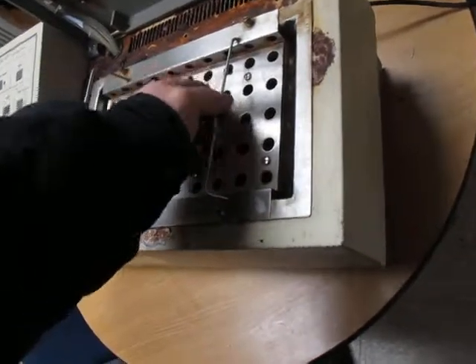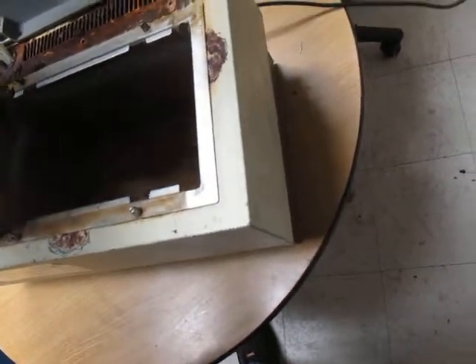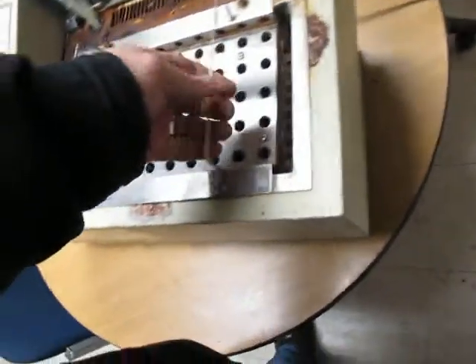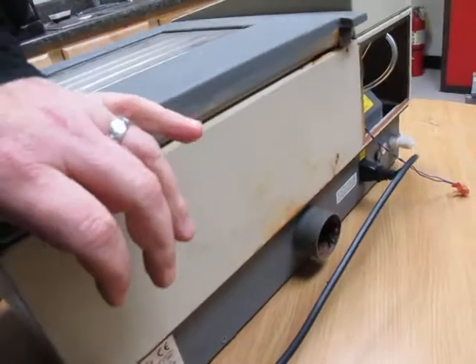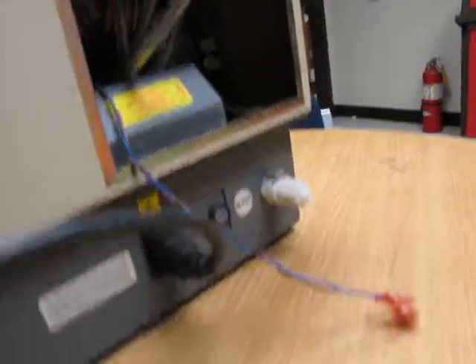It's got this vial tray thing here — bottom of the tray. I'm going to sell this for parts, not working, because it's currently not working. Some of the screws are missing so this does come apart. I don't exactly know what they were doing but that bottom piece comes off or isn't attached.